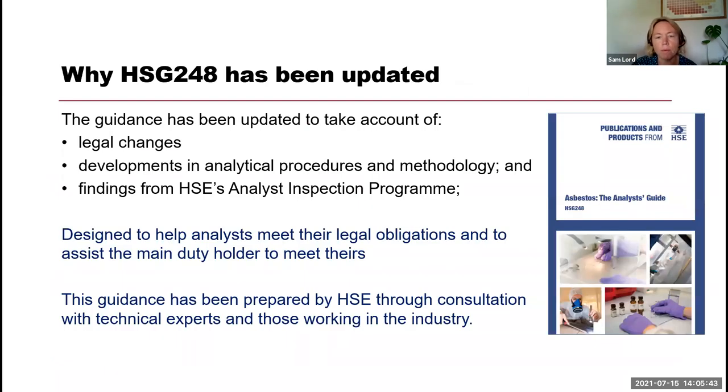So why has it been updated? You know, like most guidance, it accounts for any legal changes. So I think there's been probably a couple of revisions of the asbestos regulations and the associated approved code of practice. There's also been some developments in the analytical procedures and methodologies. So that's all been updated.